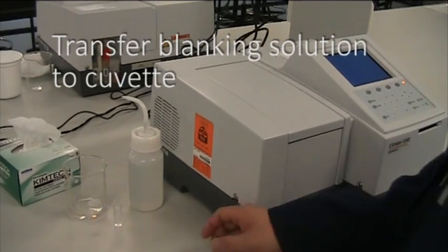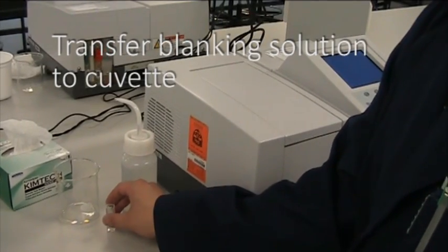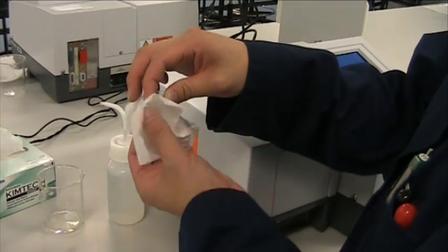First, transfer your blanking solution into a cuvette. Wipe down the clear sides of the cuvette with a clean tissue to make sure nothing blocks the light as it passes through the cuvette.